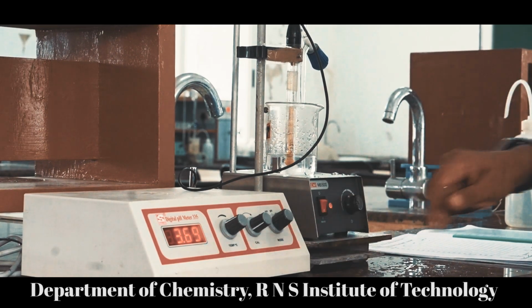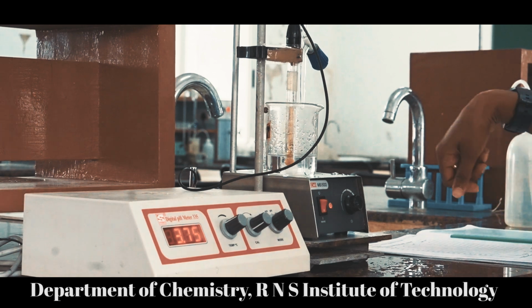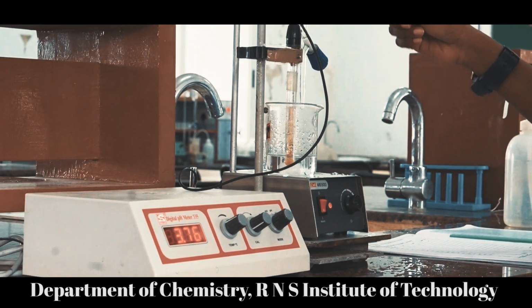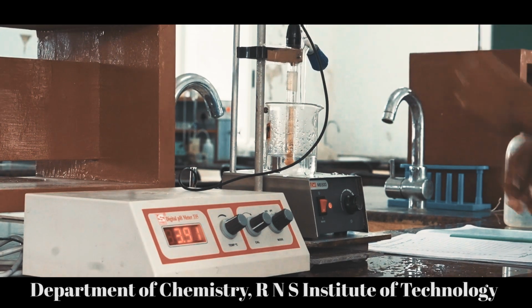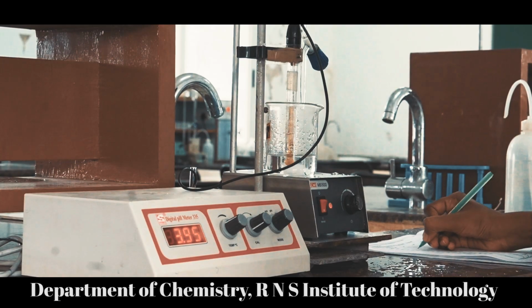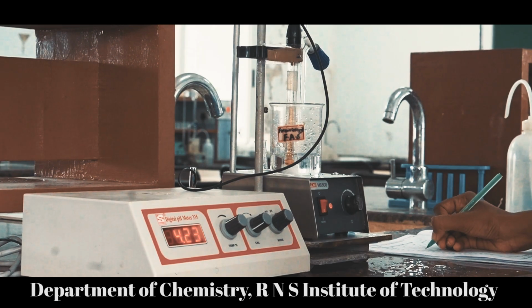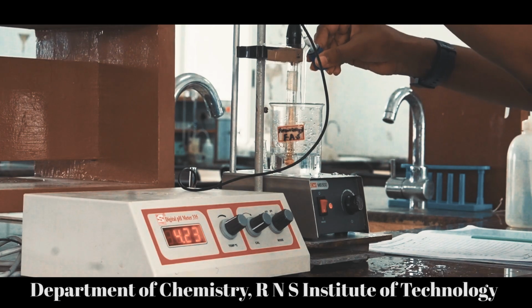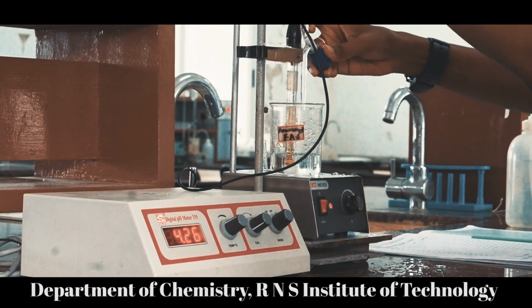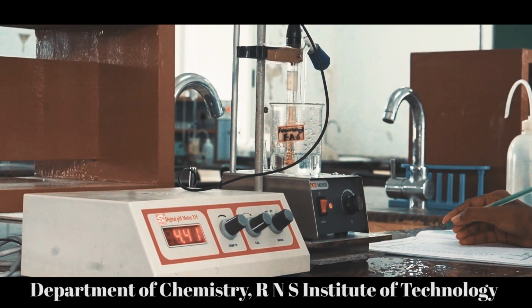Let us record the readings likewise till we get the sharp increase in the pH value. Again add 0.5 ml. Wait for some time and note down the pH.